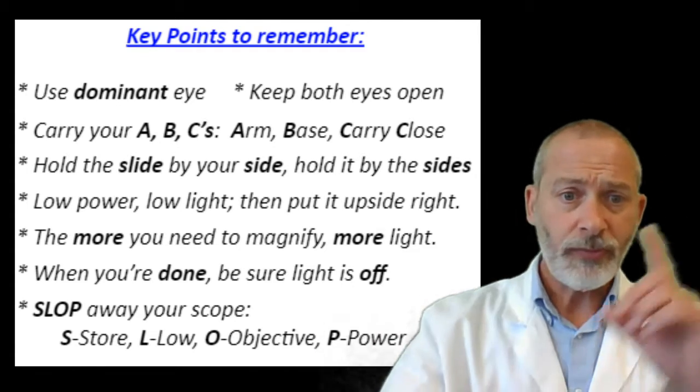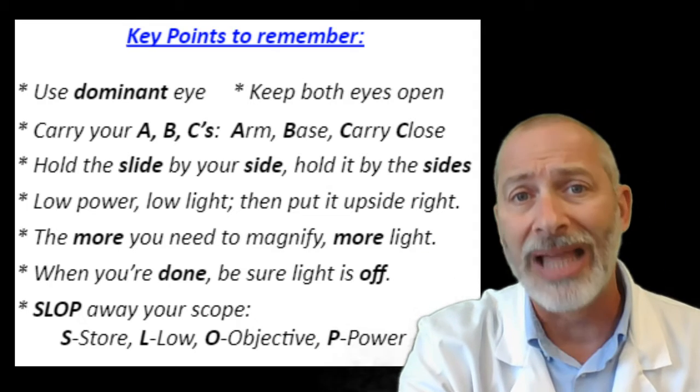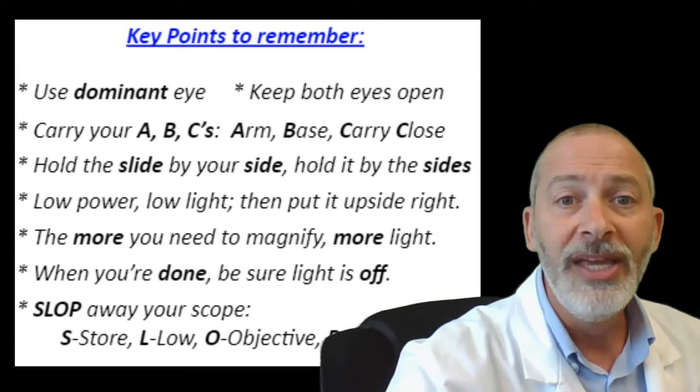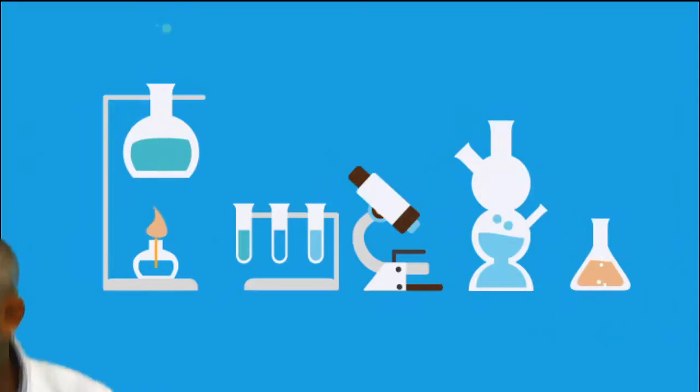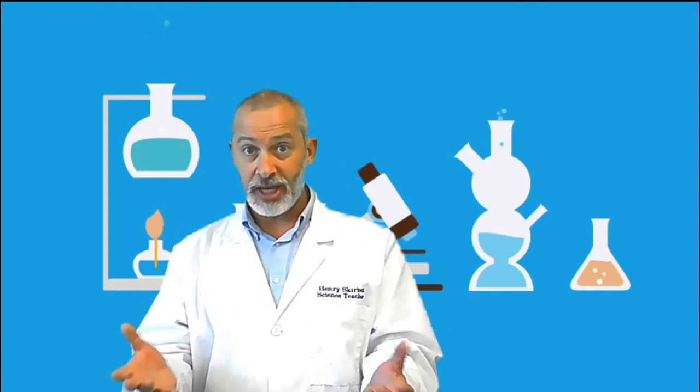First, we're going to be going back and forth between our notes here and our virtual lab. So let's talk about the dominant eye, shall we? So moving over to our virtual lab here, I'm going to have you do an activity from your tables.